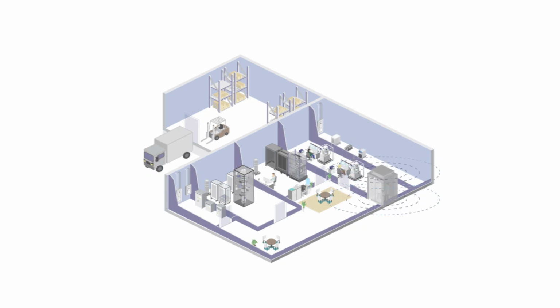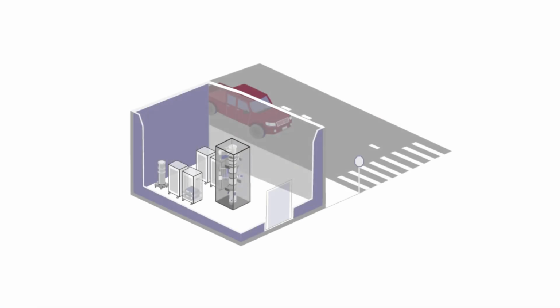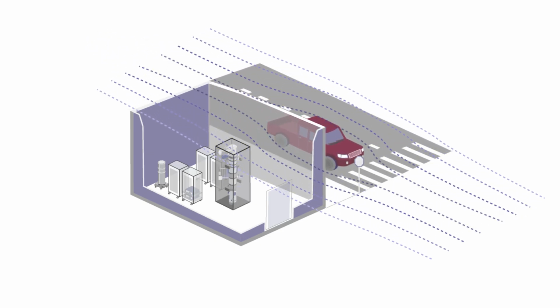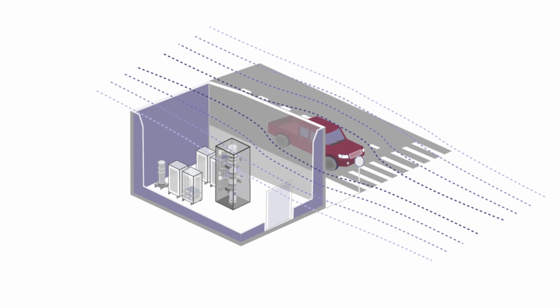As the elevators move up and down, they cause large shifts in DC fields. This is a very common source that we see, and something that you should avoid, or you need to mitigate or address if it's not possible to change the microscope location. Another consideration is if you're next to a parking lot or a road, vehicular, truck traffic, etc. As those drive by, they can cause DC field shifts as well, which is problematic and something we've seen in the past.